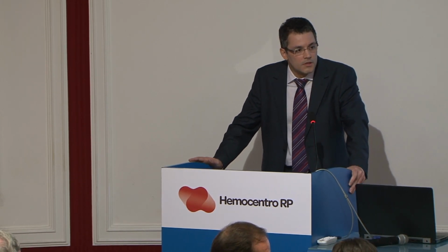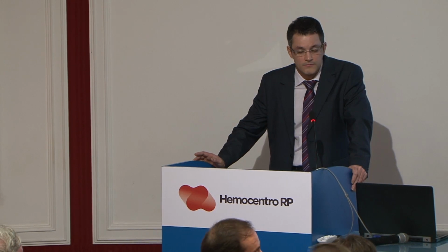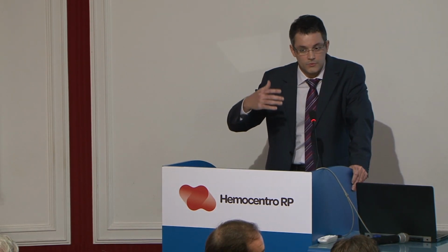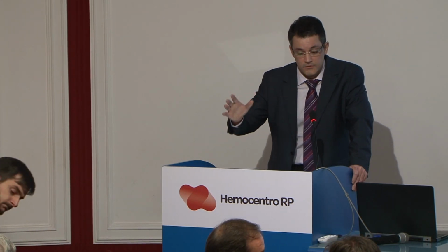So I'm going to talk about T cell expansion protocols. My goal here is to give you some principles in terms of cell biology, how we use the pathways of activation and proliferation to design our experiments and to try to produce or polarize T cells as we want, to treat our patients. If I give you the message of the principles of cell biology of T cells, I'll be happy at the end. Then I'm going to show you some clinical trial results that come from my boss at NIH, and that will be everything that I'm going to explain to you.